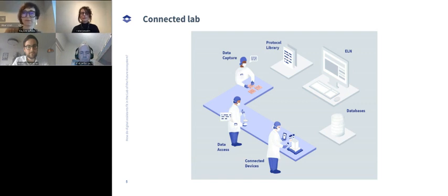So as an example, knowing when the last time this instrument was calibrated. Imagine having your digital lab assistant tell you, wait a minute, don't use this machine, it's past due calibration. Or when you bring a sample or a reagent, to say, wait a minute, that wasn't actually stored properly because that fridge went offline last night. Or in the case of people who work with polymers, the humidity today is a little bit higher than it should be, so just be mindful before you run your experiment.